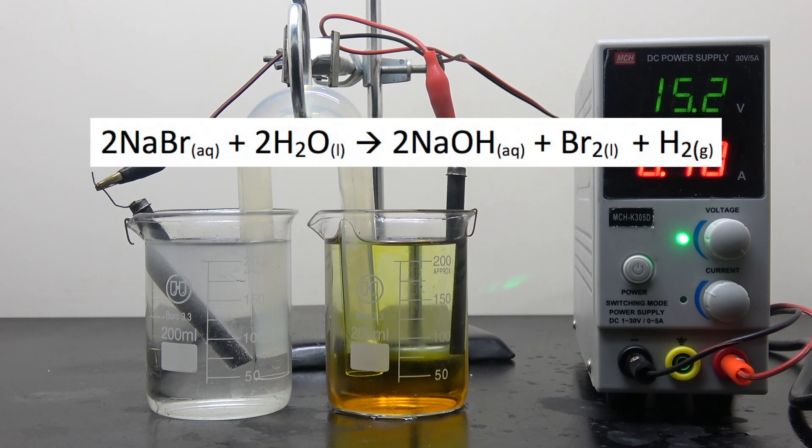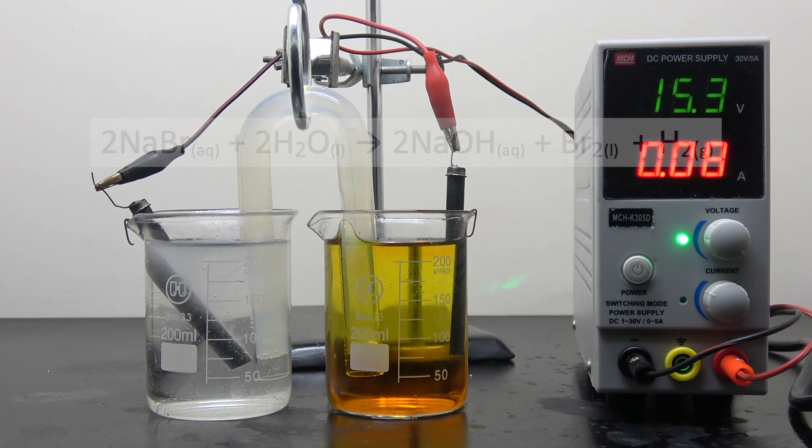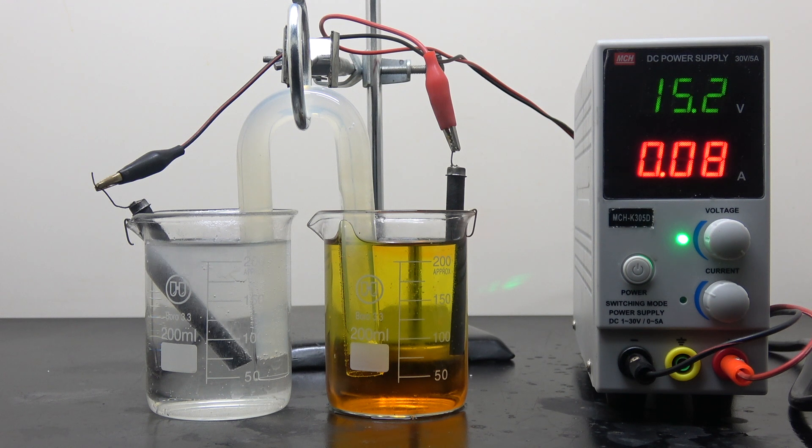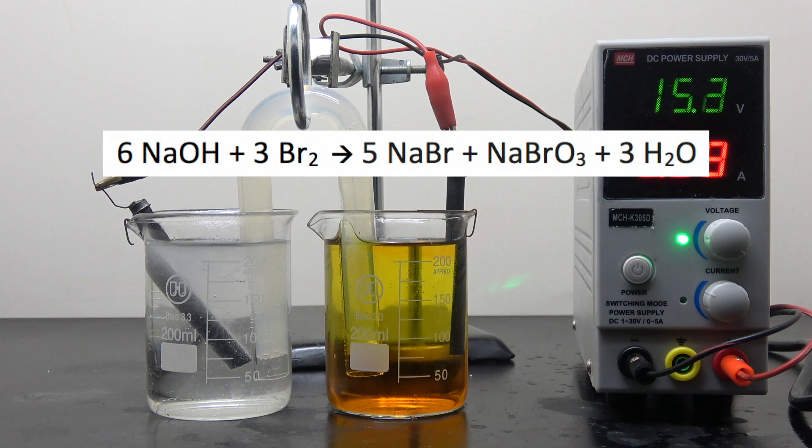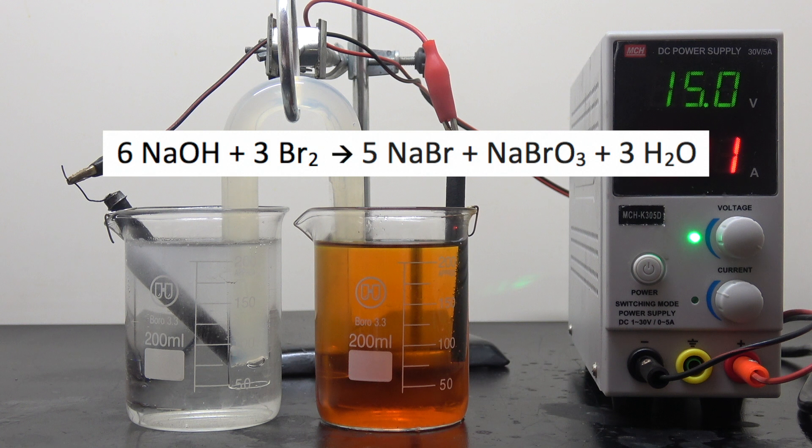So overall, for every two moles of sodium bromide, we get one mole of bromine. However, this would be very problematic if the reaction is done in a single cell, as the bromine will react with sodium hydroxide to form back sodium bromide, sodium bromate, and water. This reaction is a good way to make sodium bromate. In our case, it is totally undesired.